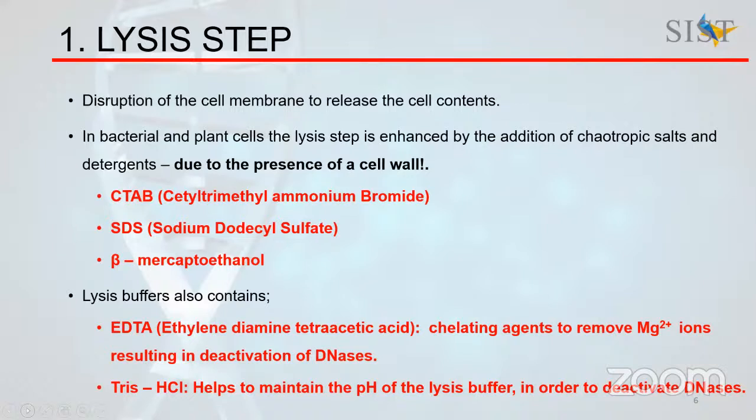And when we are doing the lysis step, we should make sure we add buffers to this lysis content. Why? Because in a living cell, all this DNA and other macromolecules exist in a stable pH condition, right? So we should maintain the pH in the same manner so that the DNA is not degraded. What buffers do is maintain the pH of a solution. So the addition of buffers to the lysis solution is important.